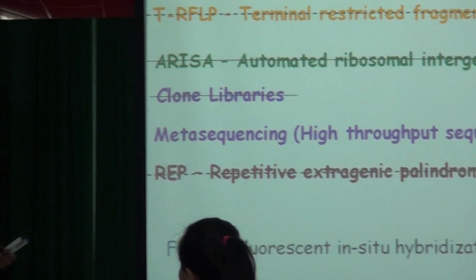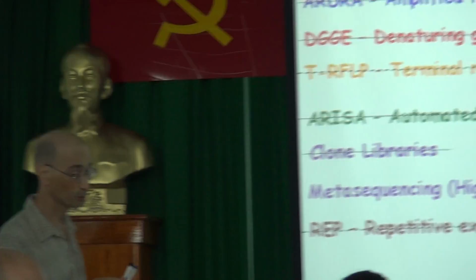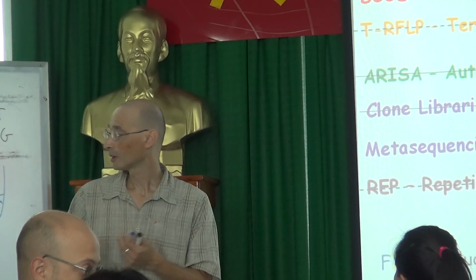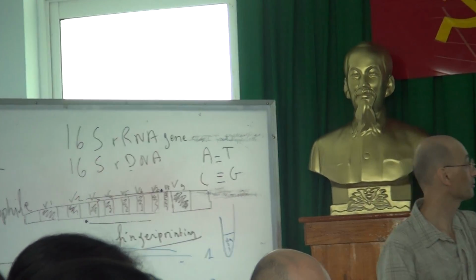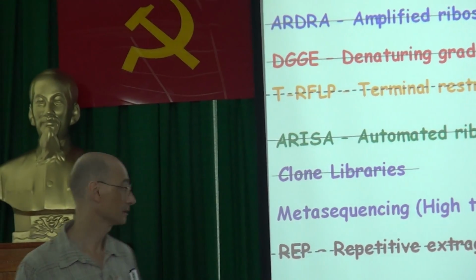Okay? Still, I'm going to talk about this method because we are still using it for one particular project, which I would like to expose to you, and also as an example of a fingerprinting method that you can evaluate, so you can see by yourself the big difference between fingerprinting and metasequencing.